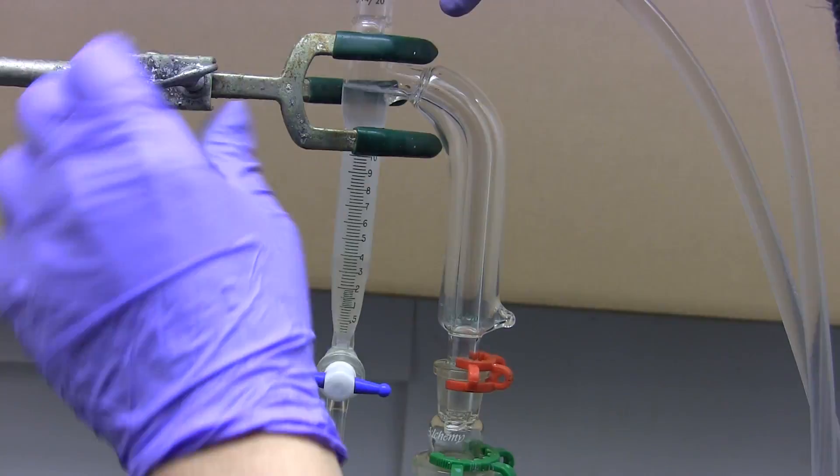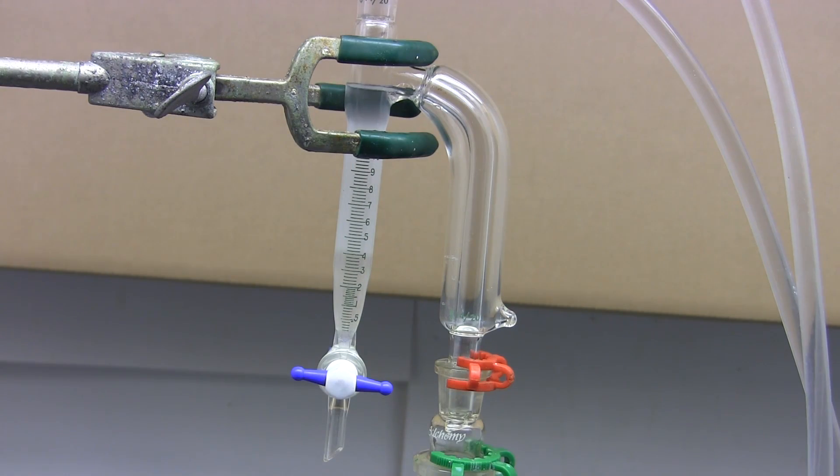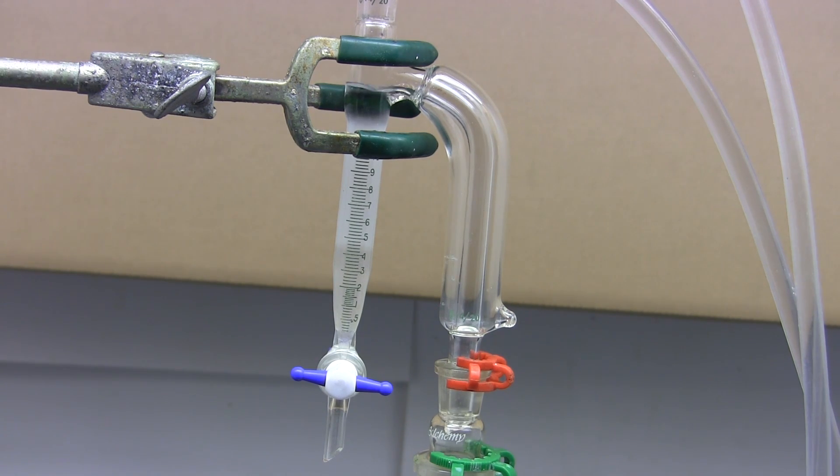Let me flip over this clamp so you can see the overflow. Anyway, as I was saying before, you can use the trap to remove water from samples as well as reactions. You can see that the process of separating the two phases and returning the lighter phase requires almost no user interaction. So for extremely slow or difficult samples and reactions, you can just set it up and walk away to spend your valuable time elsewhere.